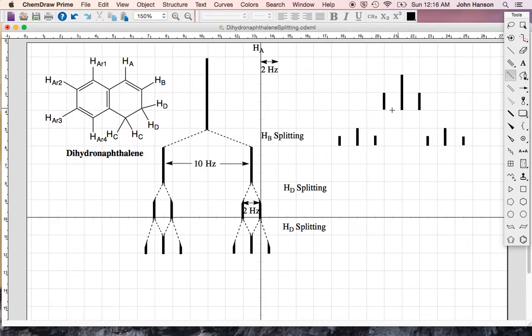If you wanted me to show the connectivity, it gets a little bit complicated here because those two go to those two. That one goes to that one, and then this one goes to this one. So you can see that there's a little bit of crossover here, but it gives you in the end the exact same pattern. I usually like to do the large ones first and then the small ones just because there's less of this sort of thing.